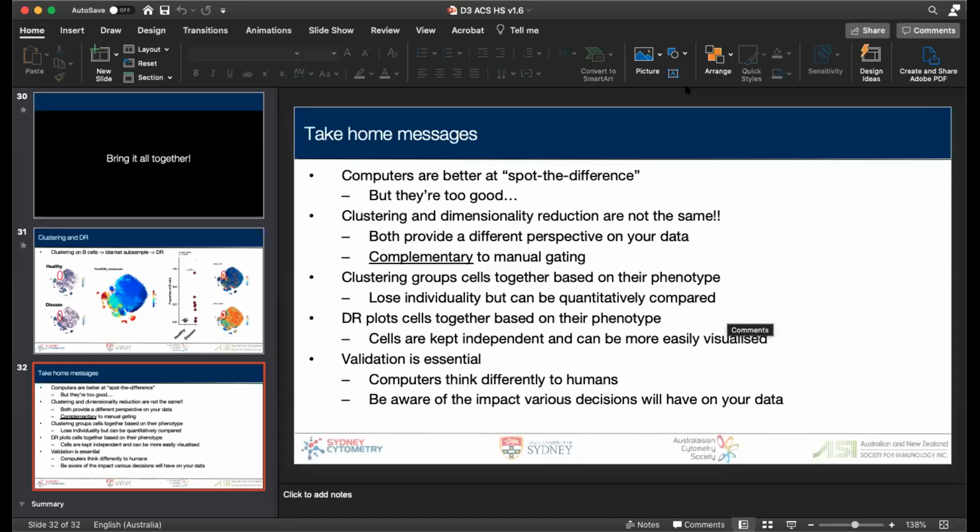As we discussed, computers see things differently, and this is where they can very easily ignore those smaller cell subsets, because based on the algorithm, it may just see them as artifacts, since there's always going to be some background.